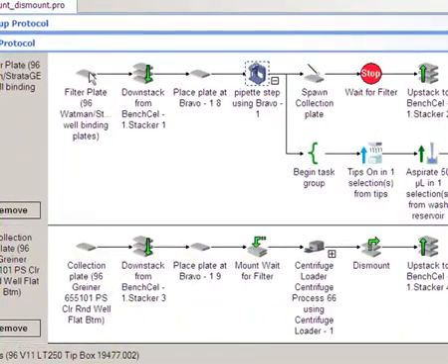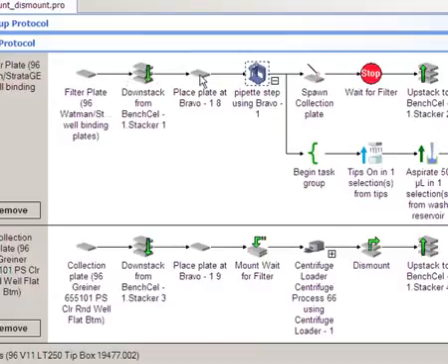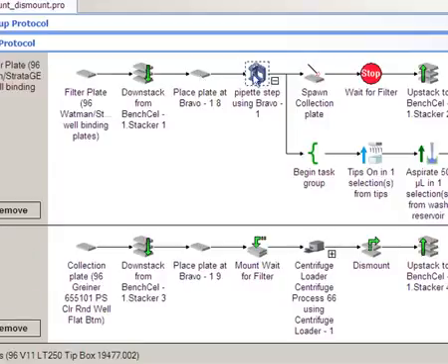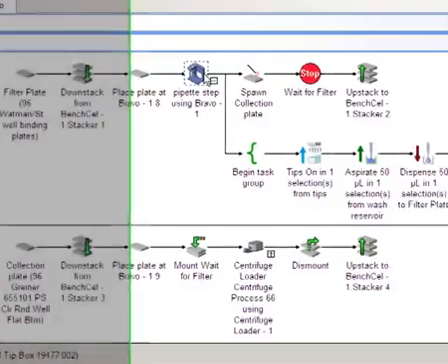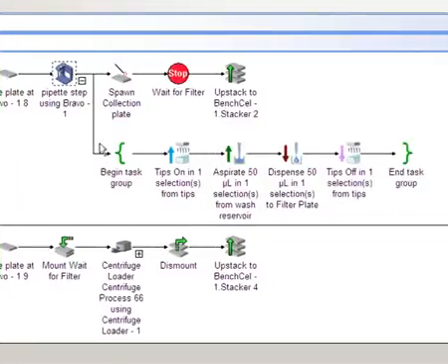In this protocol, the filter plate down stacks from the specified bench cell stacker and moves to Bravo Deck location 8. It then goes through some liquid handling tasks as shown here in the pipette step subprocess.